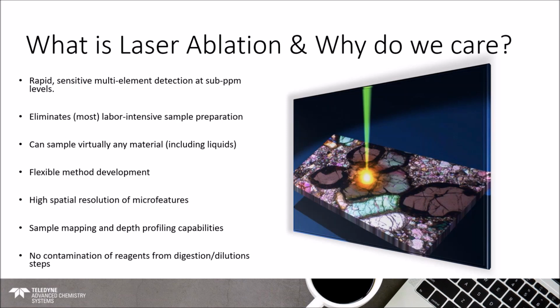You can also use this technique with just about any kind of sample. I've mentioned a couple of examples with microchips and rocks. In ecology, otolith is a very common application, otolith being essentially the bone found within a fish's ear, and it gives quite a bit of information. It can tell an ecologist anything from the diet of the fish to where it's been in migratory patterns. So lots and lots of sample types. Liquids are also possible to ablate, as are powders.